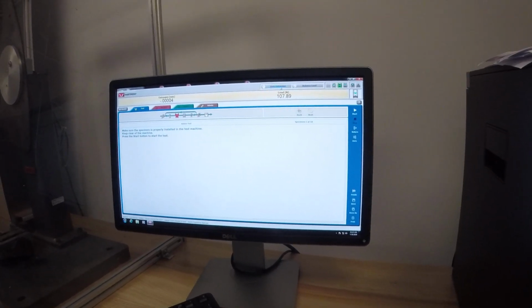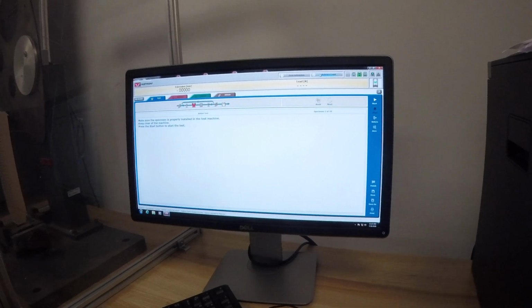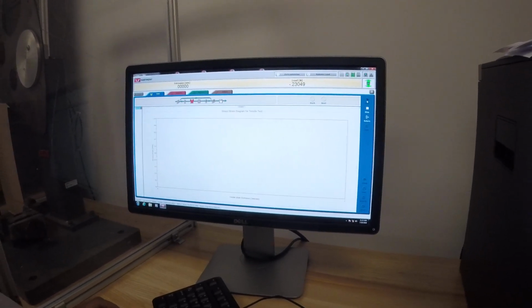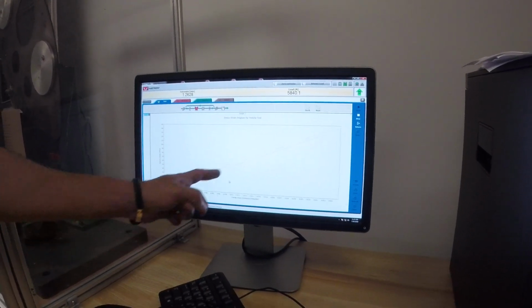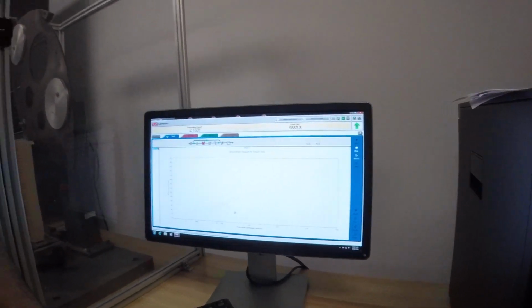So make sure you calibrate the extensometers and the load cell. It's ready. Hit start. It's going to create our stress-strain graph here. As you can see, it's going to pass elastic, plastic, and going through maximum and necking and breaking.